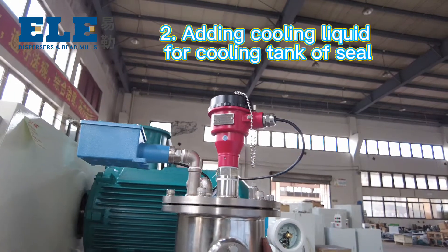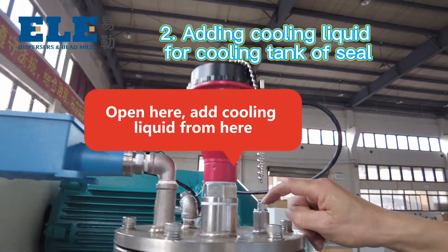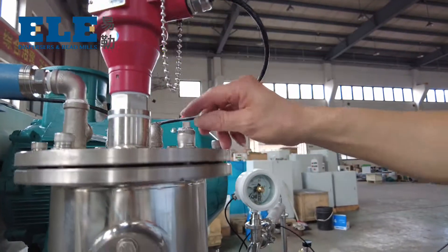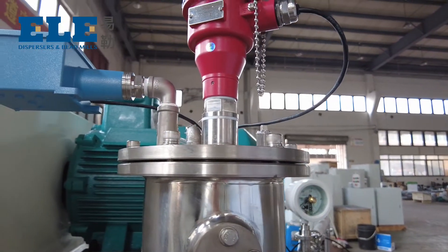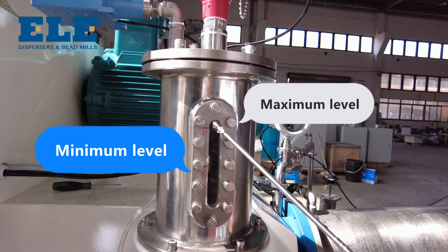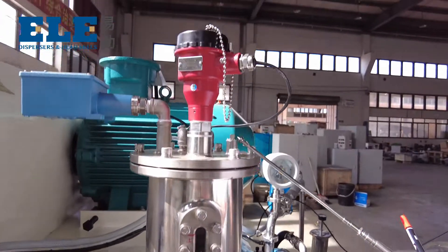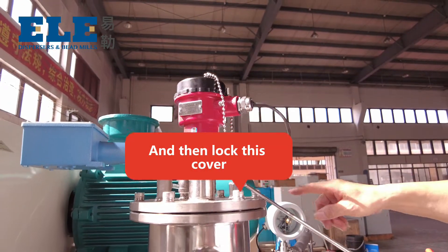Second, adding cooling liquid for the cooling tank of the seal. Open here and add the cooling liquid from here. This is the maximum level and minimum level. Then lock this cover.